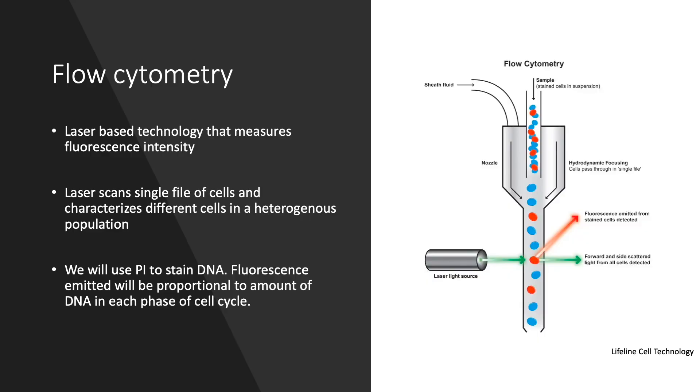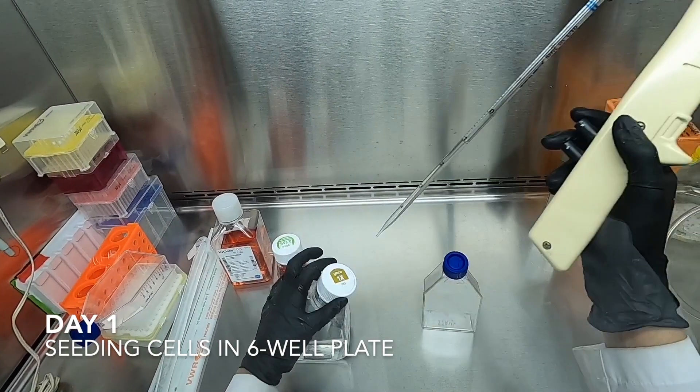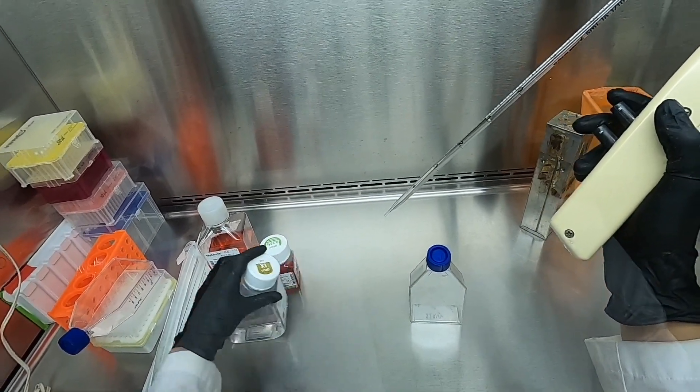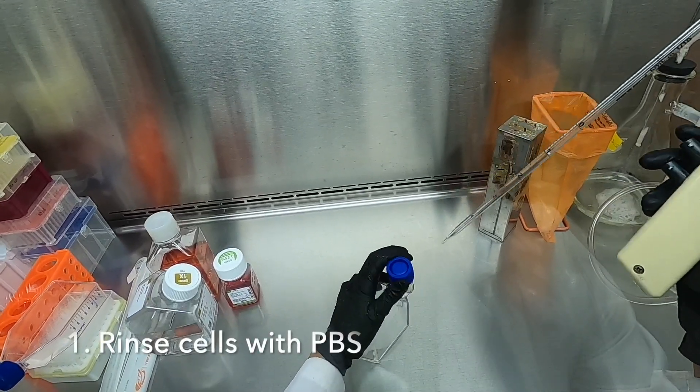We previously used PI in our cytotoxicity assay. Because PI is not permeable to cell membranes, we will be permeabilizing and fixing our cells in order to stain DNA for cell cycle analysis. So let's begin our experiment. We begin on day one by plating our cells in a six-well plate. This is done by following the same steps that we used in our previous video for cell passaging.